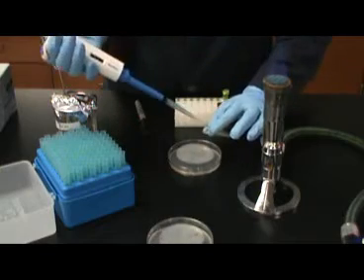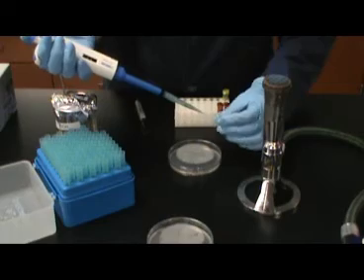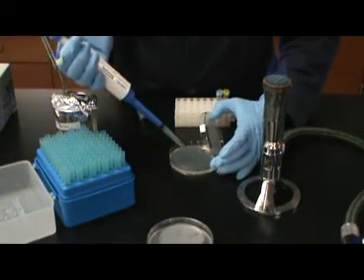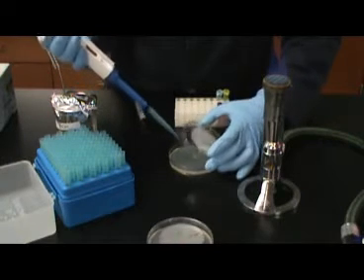500 microliters is a fairly large volume to be inoculated on a single Petri plate. Make sure after inoculation that you allow the plates to sit on your lab bench for about 10 minutes. This will give ample time for the fluid to absorb into the agar.